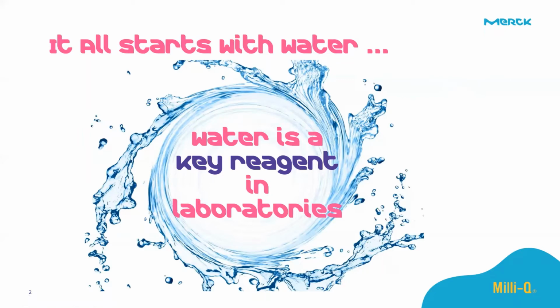The good thing about water is that it's an excellent solvent, it's readily available, but very little consideration is given to getting the right quality of water.